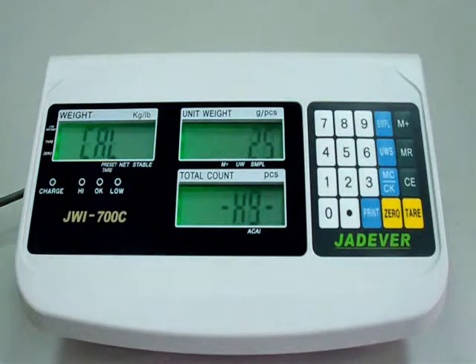Put the corresponding weight on, then press key UWS. The digit is flashing.